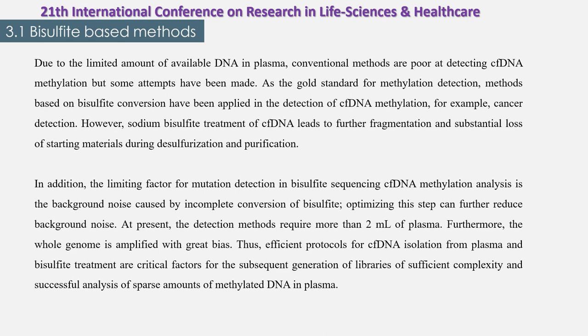In addition, the limiting factor for mutant detection in bisulfite-sequenced cell-free DNA methylation analysis is the background noise caused by incomplete conversion by bisulfite. Optimizing this step can further reduce background noise.